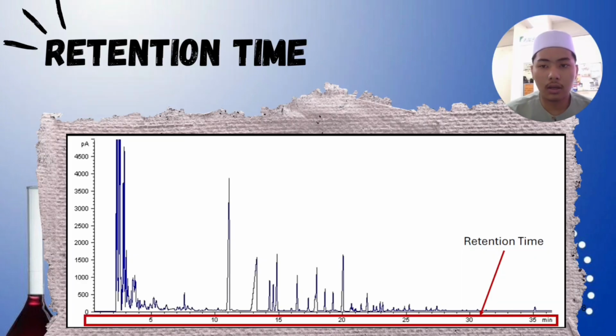So let's look at retention time. Retention time is the time required for the sample to travel from the injection port through the column to the detector. In the table, we can see that retention time is on the axis. The SI unit for retention time is minutes, which we can see in the table: we have 5 minutes, 10 minutes, 15 minutes, and so on.